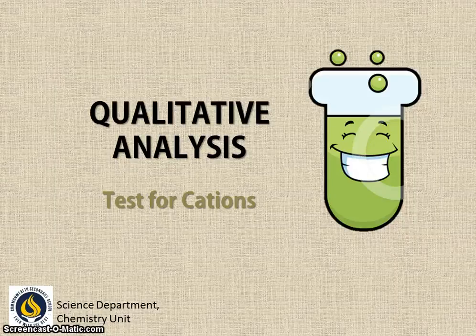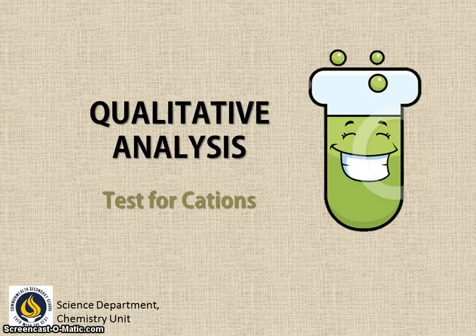Qualitative Analysis, the test for cations. In this video, you will get to learn about the procedure in conducting the test for cations and the results you should expect to get for 8 cations in our syllabus.